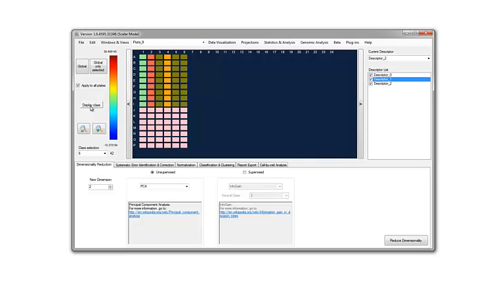There is something you have to be careful about: when you are applying a new class to a well, it is by default applied to the entire screen. It means that this well will also be set up with the same class on every plate. So if you want to change the class of only one plate, you have to uncheck this button, and you can see that the cursor is also changing. And as you can see now, when I'm moving from one plate to another, the well is selected only in plate number 6.